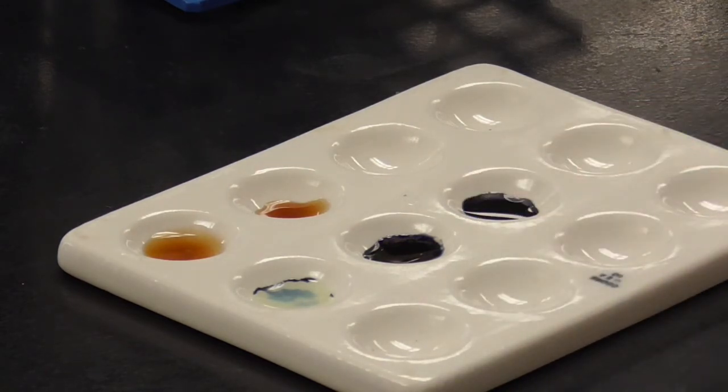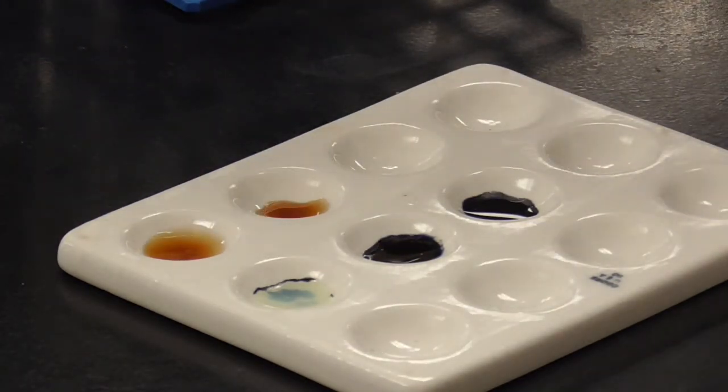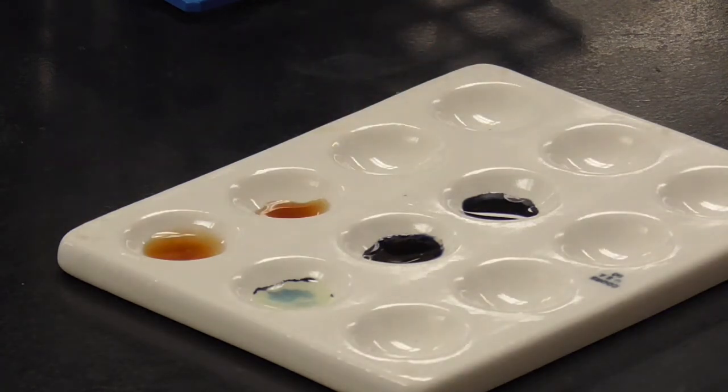Right? And so looks like the heavy metals are definitely inhibiting it. Sodium chloride did not. That doesn't surprise me too much. We have a lot of salt in our body as well. Ethanol, that's kind of interesting. Ethanol will often interact and denature proteins, but in this case, didn't seem to phase it one bit. We definitely had activity there. So possible inhibitors, there you go. It sounds like the heavy metals inhibit amylase.